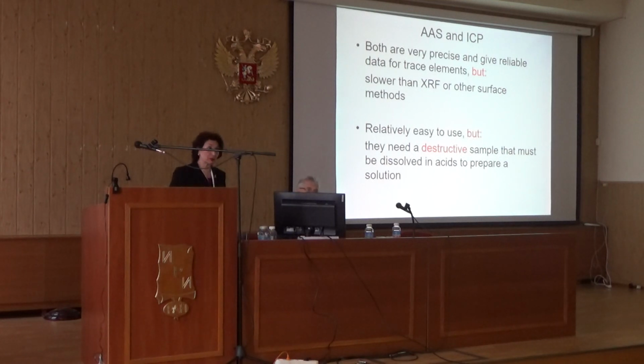There is a program for that, so it takes longer. But with ICP and atomic absorption, you need the samples, which is destructive, and you need to prepare a solution. The solution can then be analyzed, so it takes longer simply, but it is very precise.